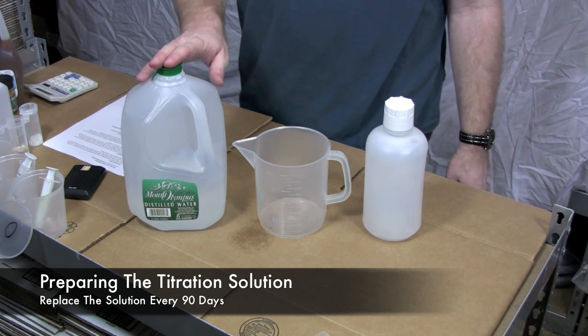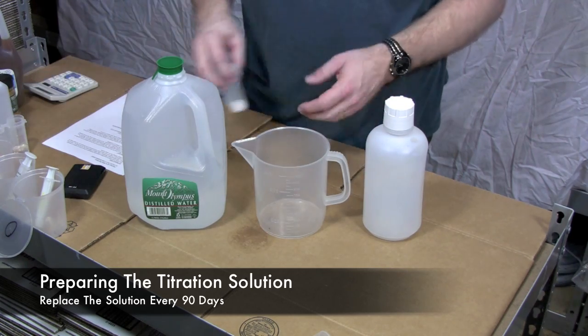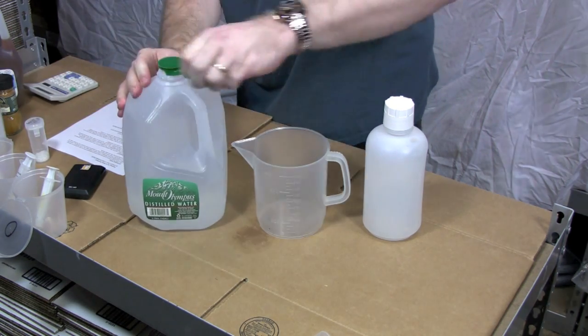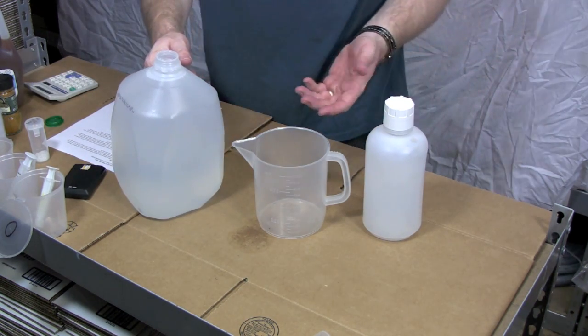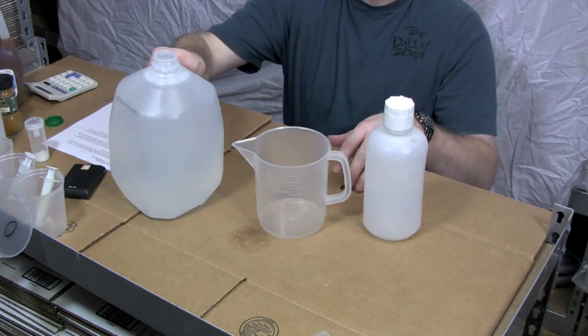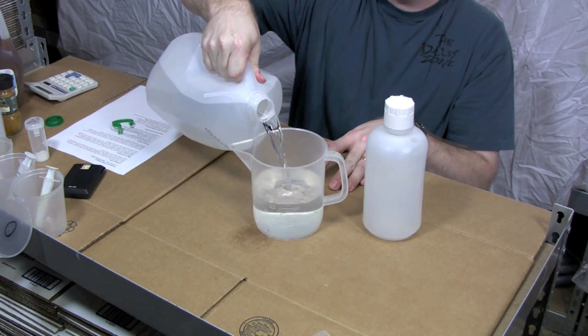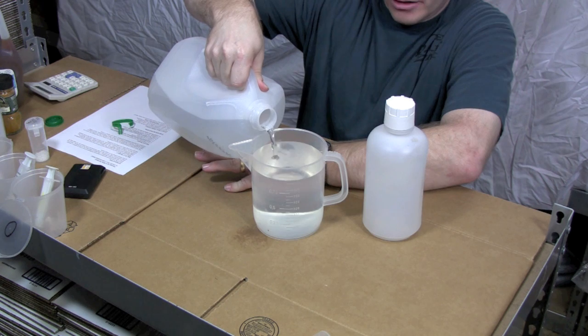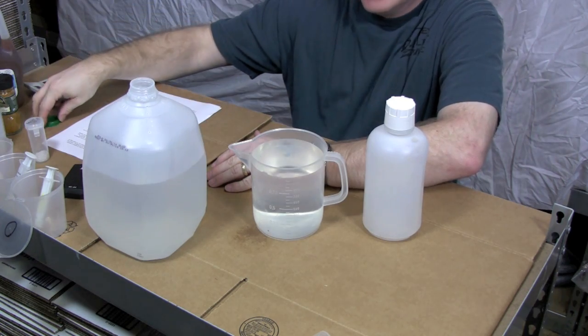The next step we're going to do is prepare a titration solution. To do that we need to measure out a liter of water. I have a very accurate measuring cup. You can purchase these on Utah Biodiesel Supply or you can go into most grocery stores and find anything that just has a liter marking on the side. But it's important that you fill it right to the liter mark. This is distilled water and it's important that you use distilled. If you use other water the water can be acidic or basic. This distilled water is perfectly neutral because what we're trying to measure in the oil has to do with measuring pH.